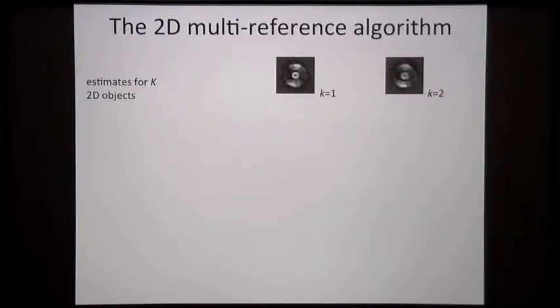Okay, now the way it works, you just extend what I've told you before. And now, rather than having only the missing data, these rotations, we add another type of missing data, which is a class assignment. Okay? We're going to take 2 initial references, and they're a bit different, and I'll come back in a moment to how they're different. Okay?